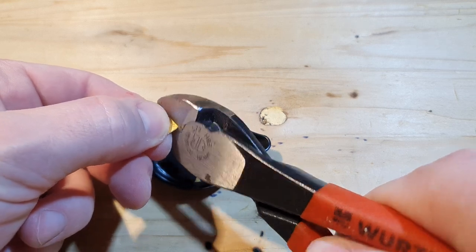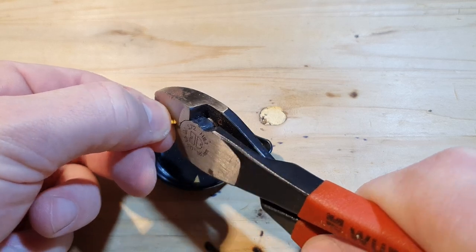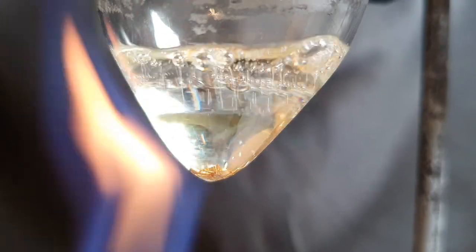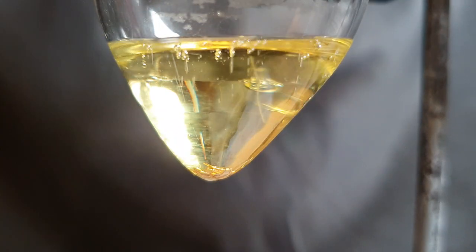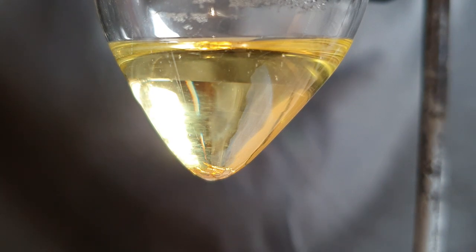The first step was to cut the gold bar into smaller pieces to increase the surface area. Because I do not have any nitric acid, I first tried to dissolve the gold in a mixture of concentrated hydrochloric acid and 11% hydrogen peroxide.